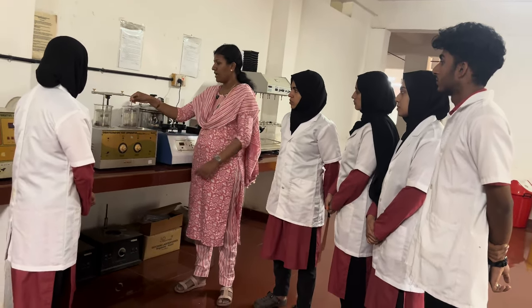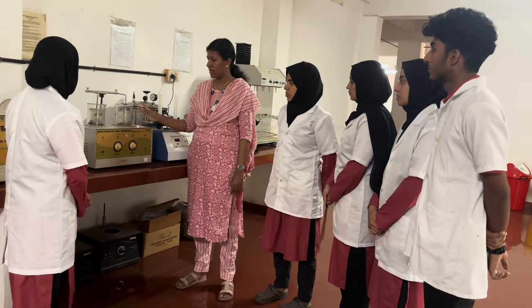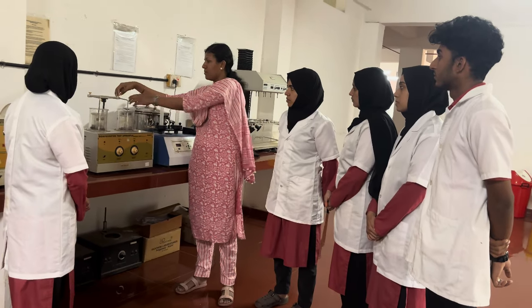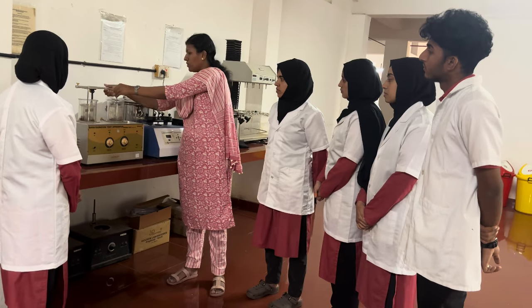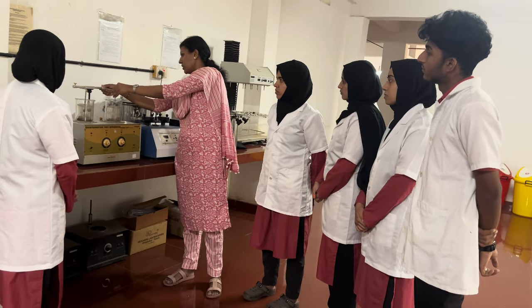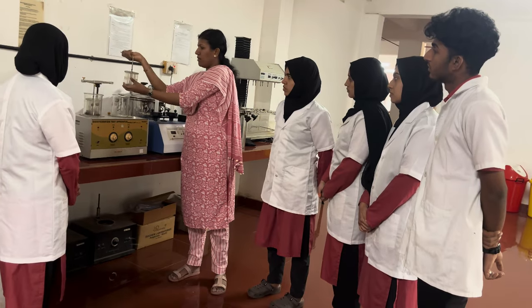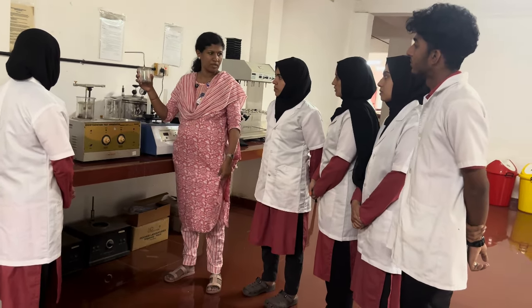You can see it consists of a basket rack assembly and it is placed inside a beaker. What is this basket rack assembly? You have studied in the theory portion that you have a basket rack assembly for the disintegration test of tablets. Okay, this is the basket rack assembly for the disintegration test.